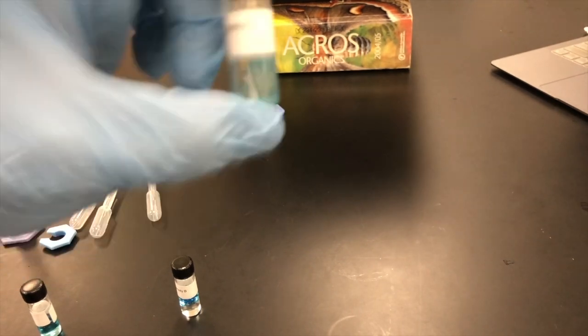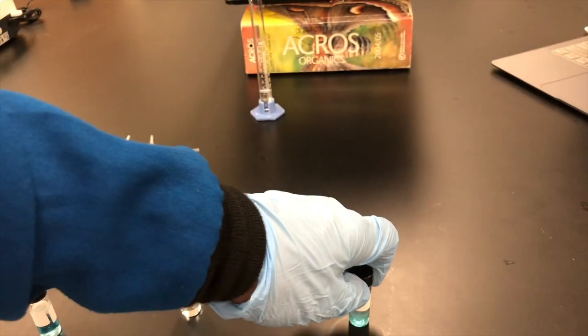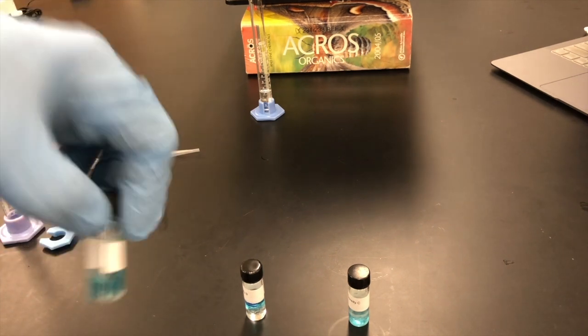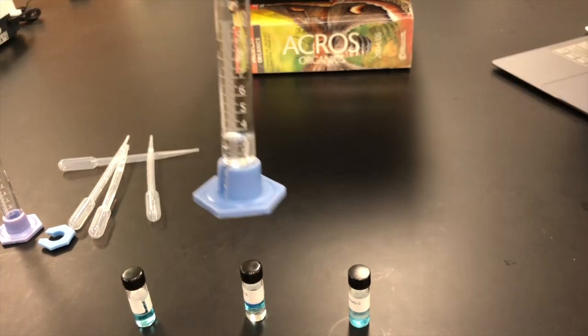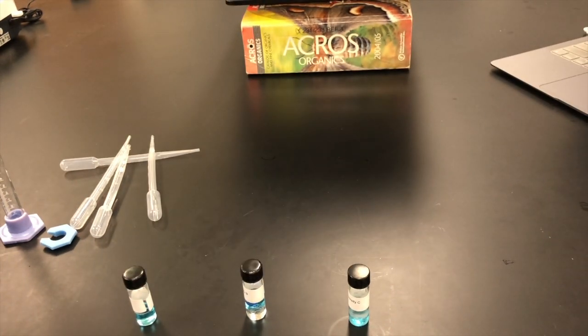Go ahead and shake each one of these up and see whether or not they mix. Shake it up, let it sit for a while. And as it sits, go ahead and take your cylinder with all three liquids and add water to that.